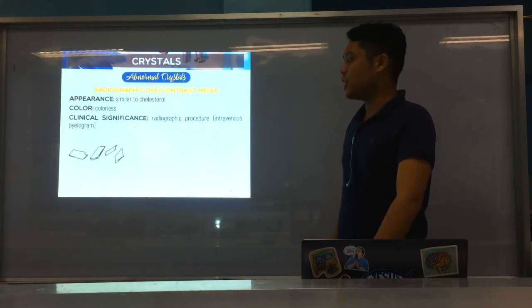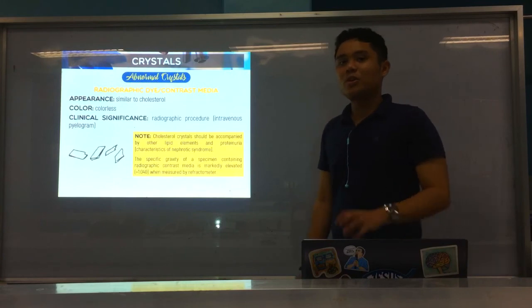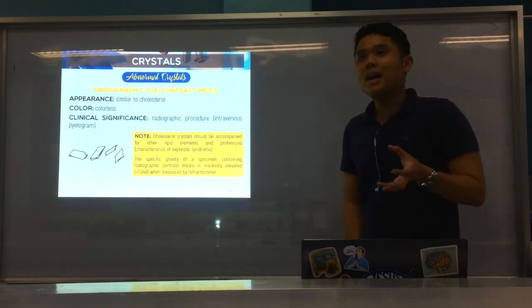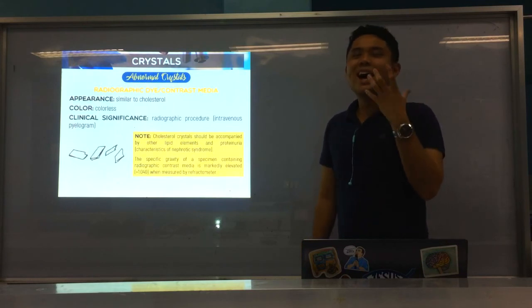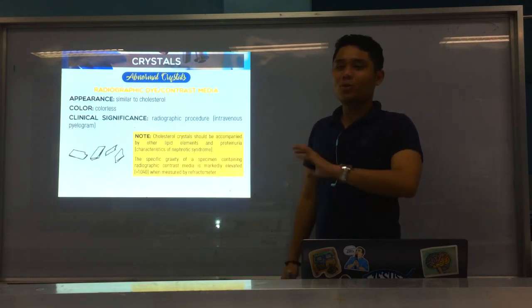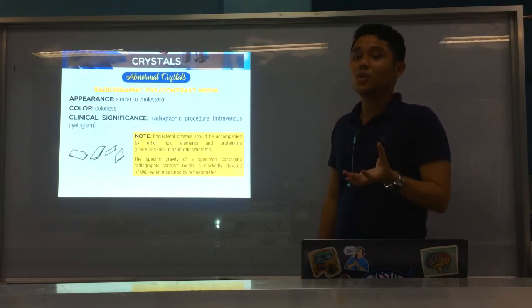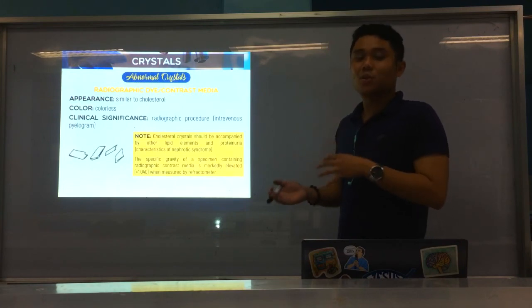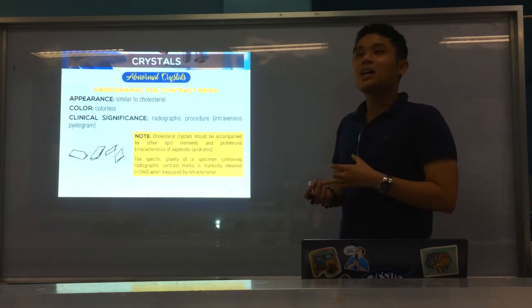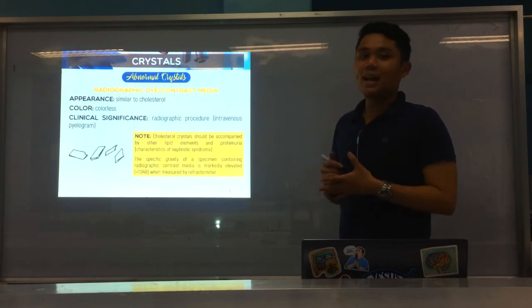So how do we differentiate? Again, you always have to remember that cholesterol crystals again are notched pattern, di ba? And usually makita siya in nephrotic syndrome. So if you're suspecting nephrotic syndrome sa cholesterol crystals, then always look again, as I mentioned, for different parameters or different results sa urine na makapoint ka na nephrotic syndrome. So massive proteinuria, oval fat bodies, mga ing-ana, okay?